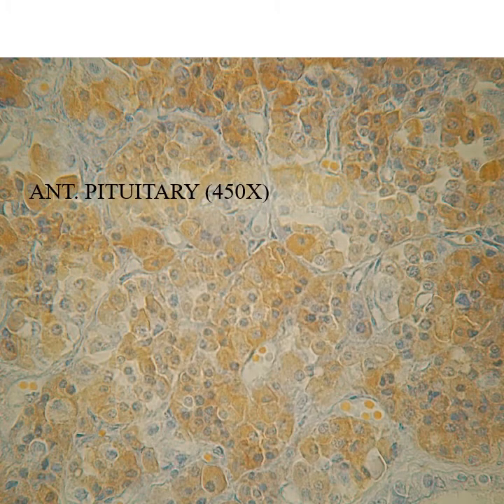This one is a high magnification of the anterior pituitary. It's trying to show the differential staining you can get in the anterior pituitary. Different cells will stain differently depending on which class of hormones they secrete. I won't ask you this. This is a much higher magnification than we get with our microscopes. We only go to, well, we go to about 400. This is a little higher.